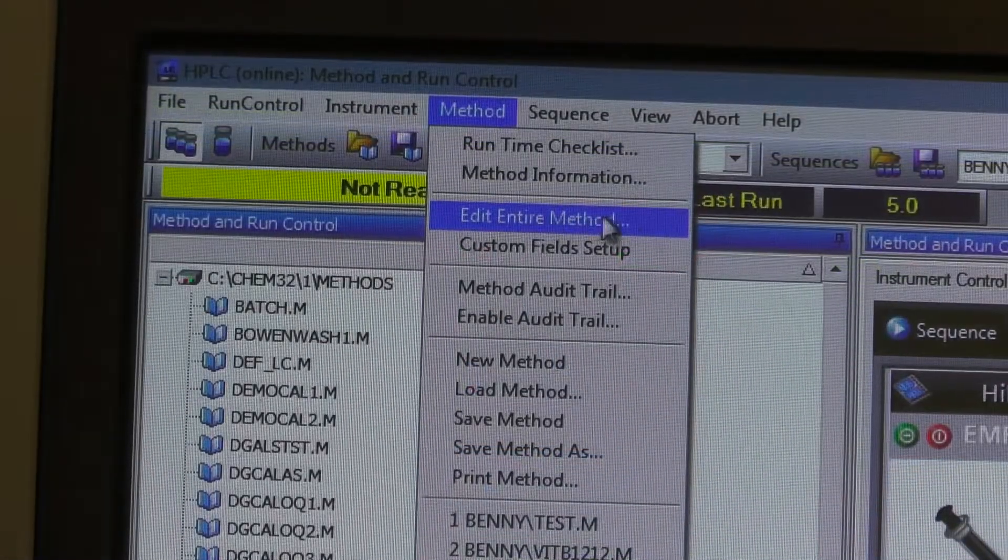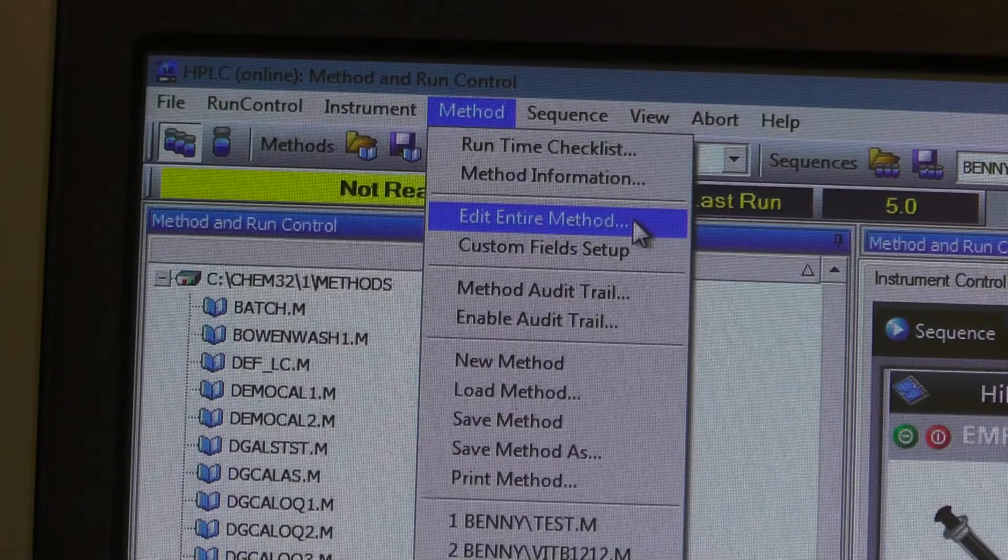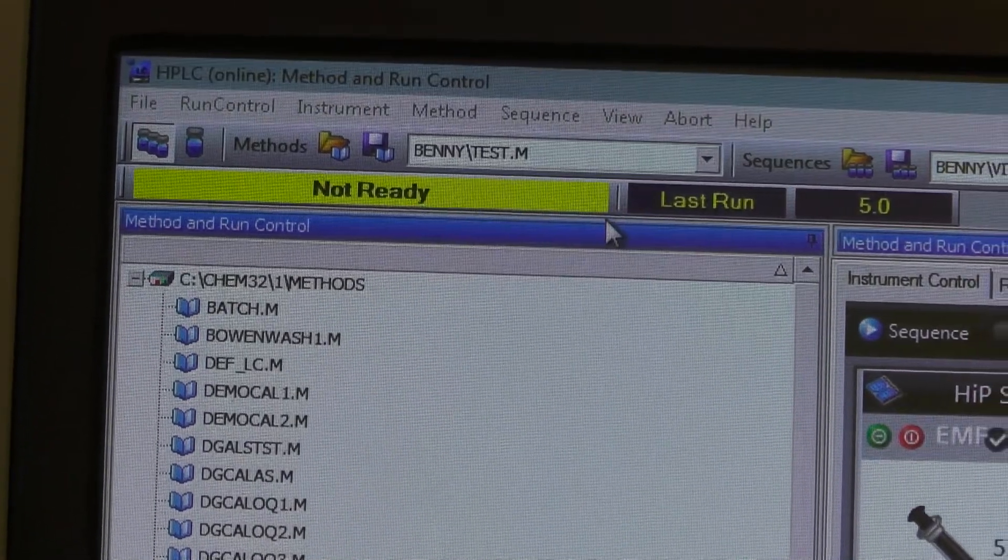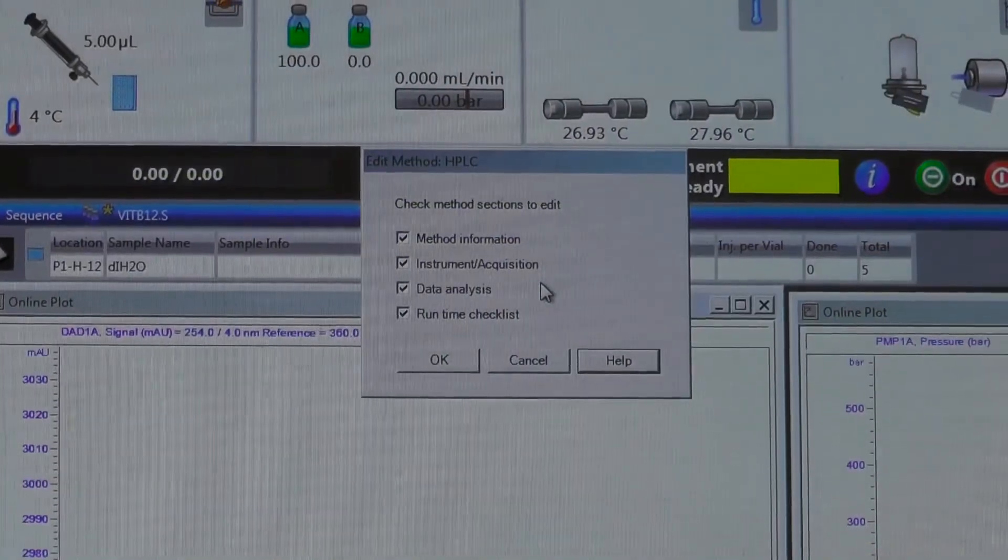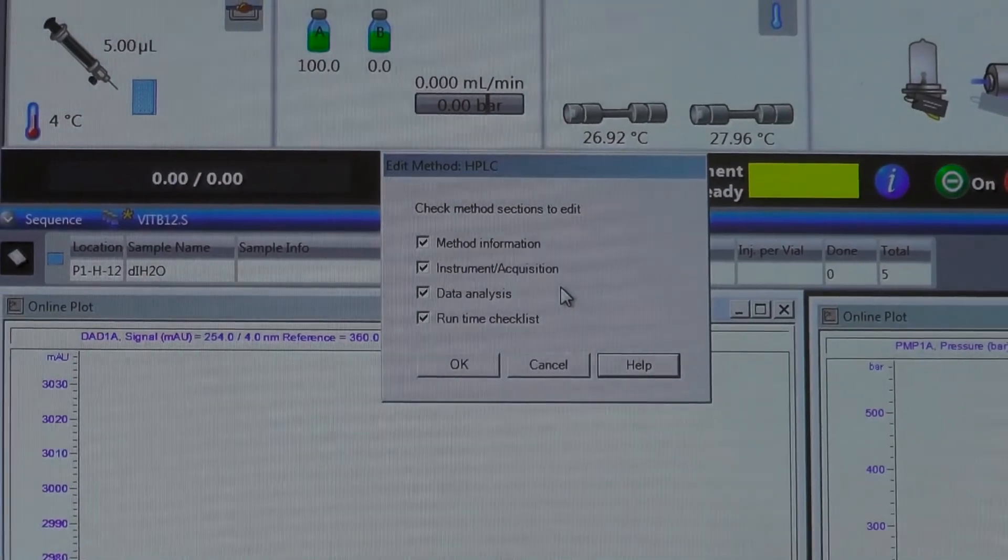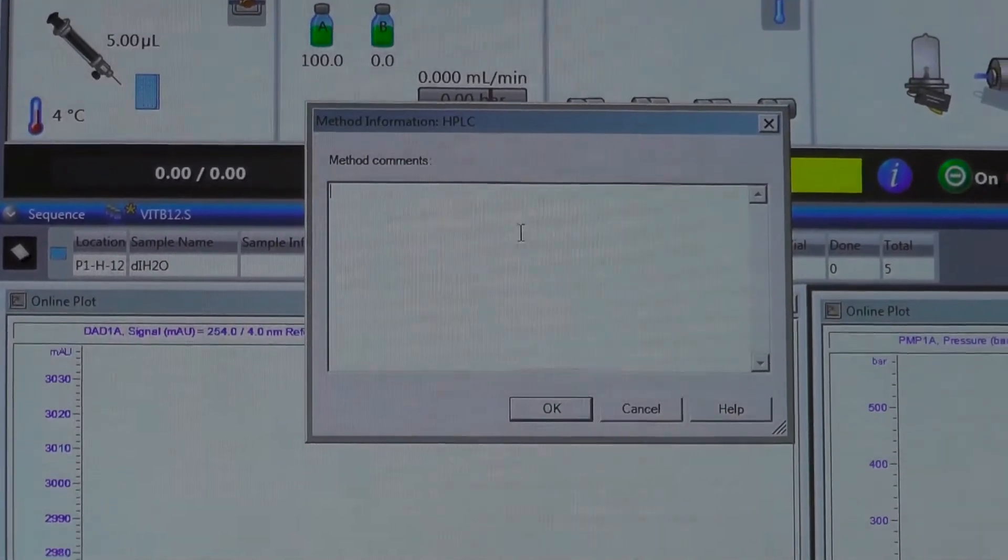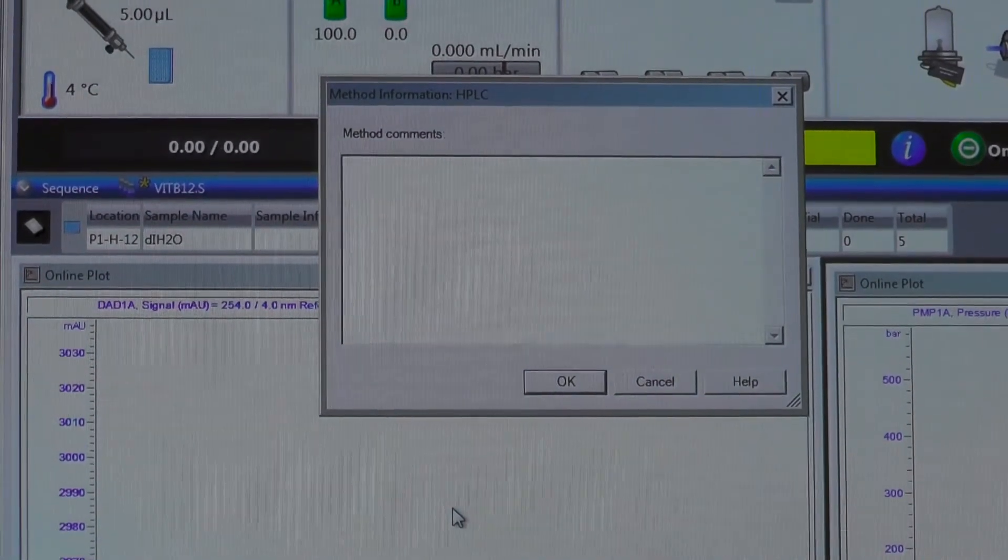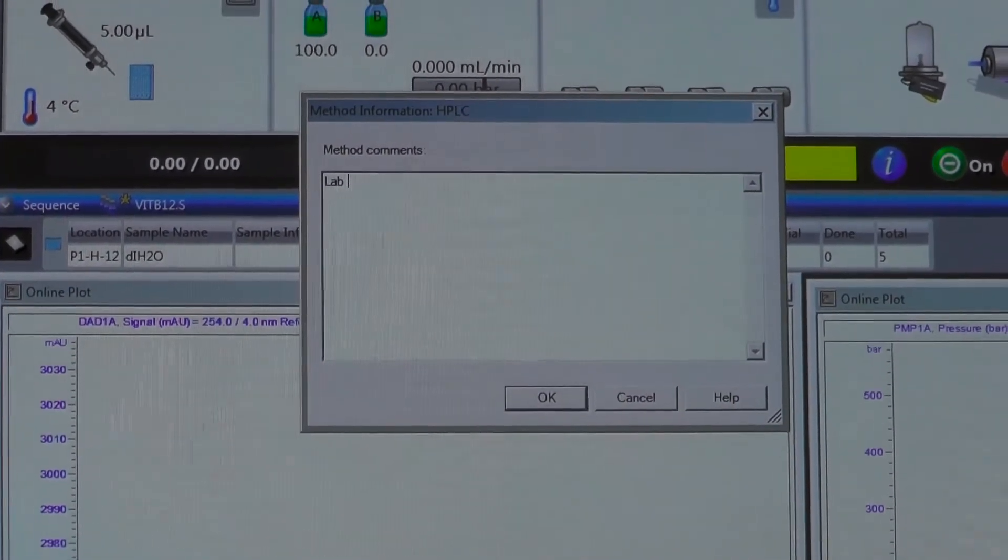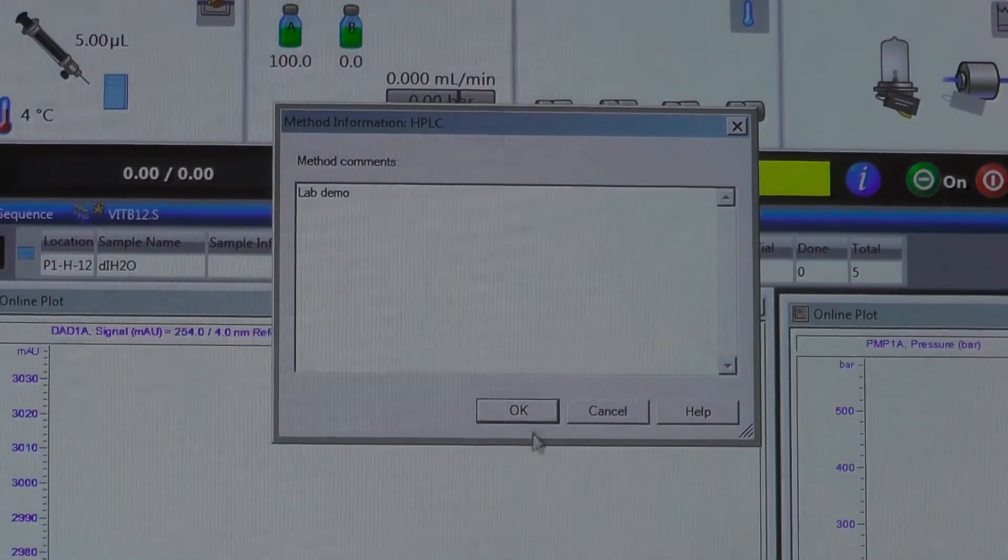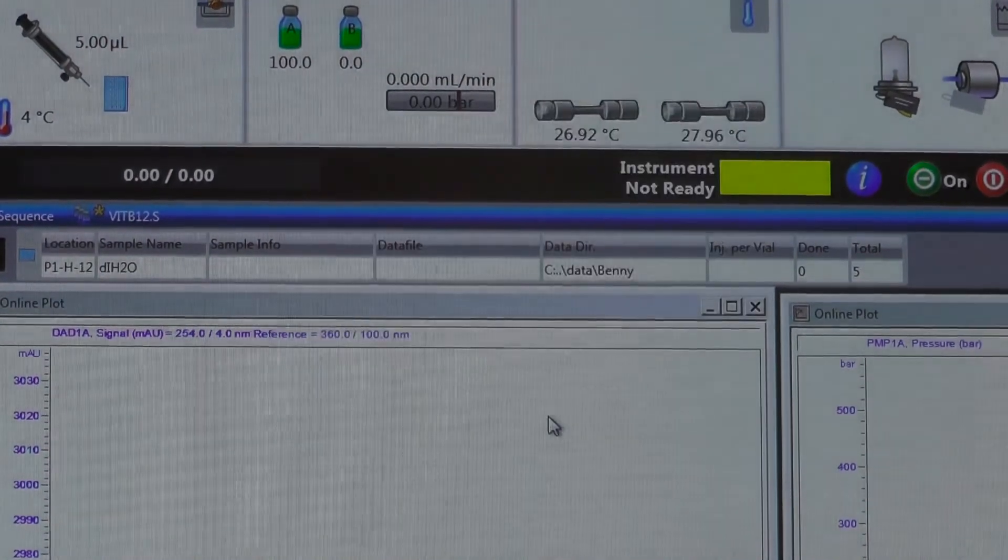To edit the method, click on the Edit Entire Method tab under the Method menu. Select all of the options on the checklist and write down details about your method in the comments. Here we only wrote down lab demo for demonstration purposes, but in an actual experiment, you should write down as much detail as possible. Click OK.